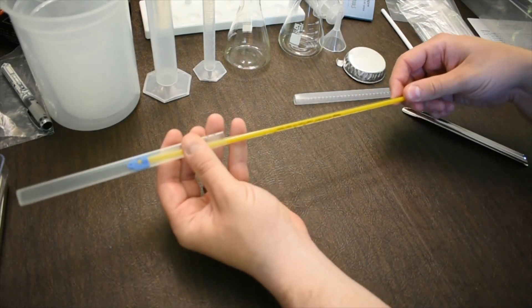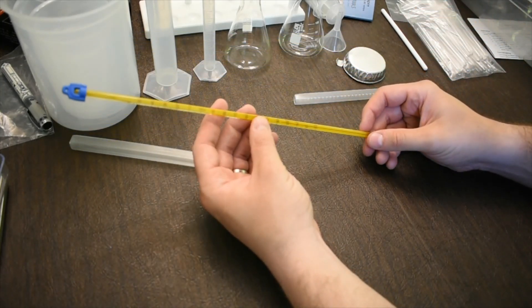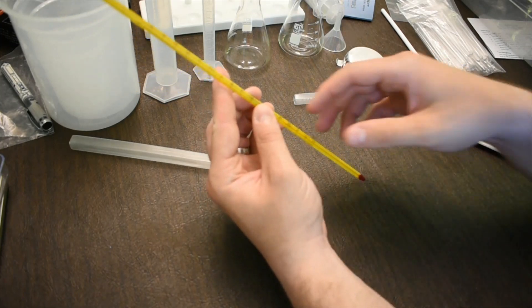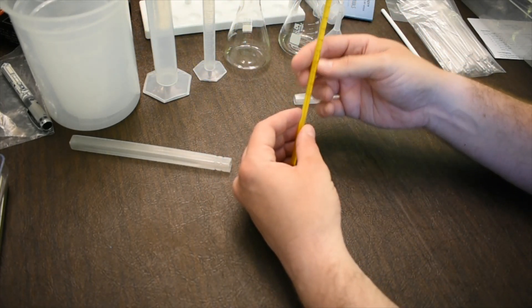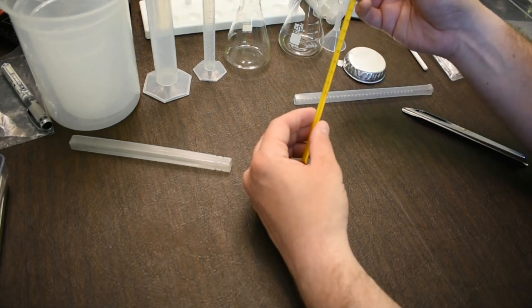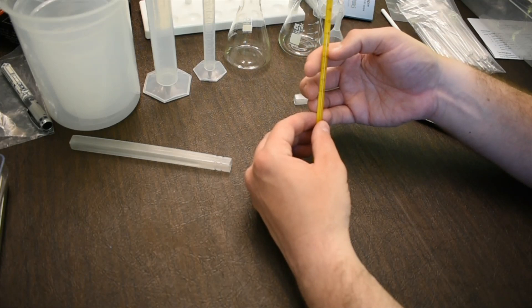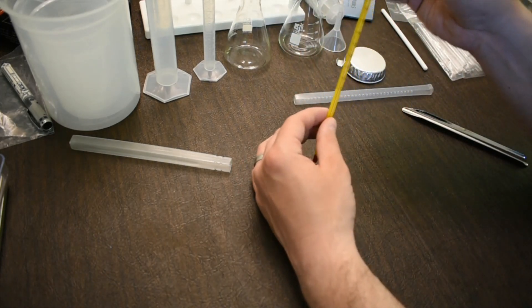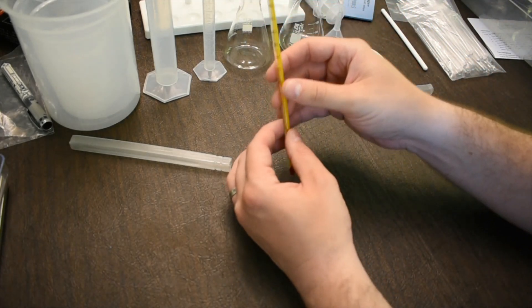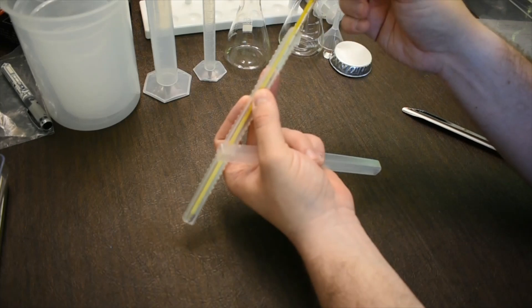The thermometer is a glass component, so we have to be careful with it. This particular thermometer goes from minus 10 degrees Celsius all the way up to 150 degrees Celsius — we'll never go that high, but it will allow you to measure temperature. Because it's glass and can break, when you're not using it, make sure you leave it in the little plastic keeper.